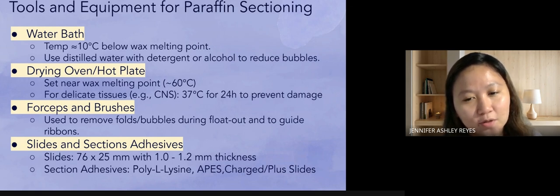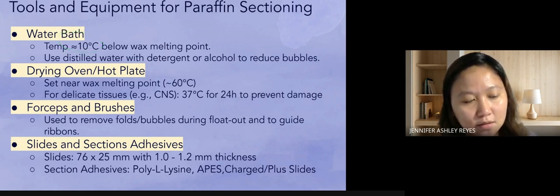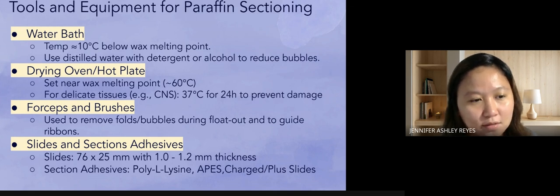The temperature for the water bath is ideally 10 degrees below the wax melting point, in this case the paraffin melting point.